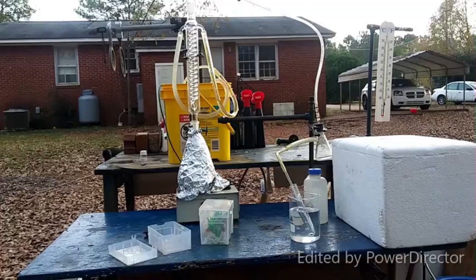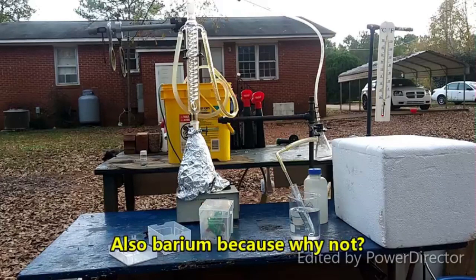Hello everybody and welcome back to the Poor Man's Chemist. In this video we are going to attempt to dissolve europium metal in liquid ammonia.